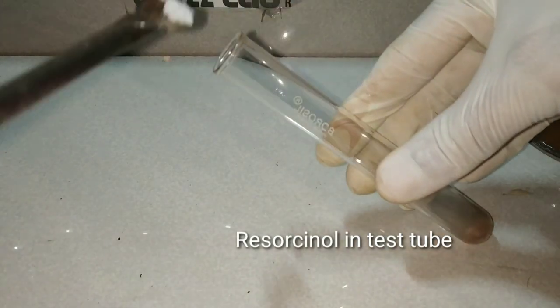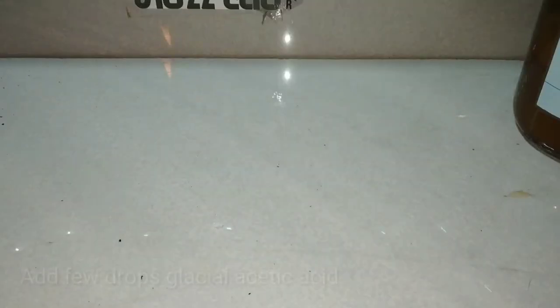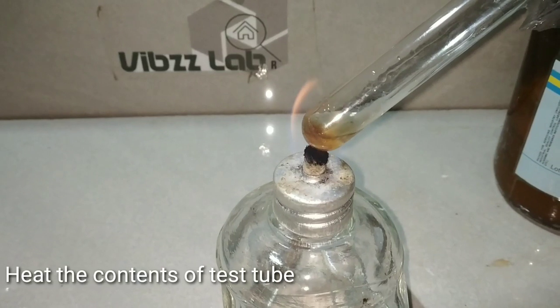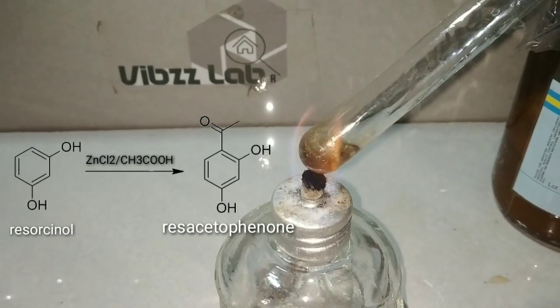We have taken some resorcinol in the test tube and we are adding zinc chloride into it. Now we will be adding glacial acetic acid. After adding this, we will be heating the contents of the test tube to about 145 degrees Celsius when we get a compound called resacetophenone.